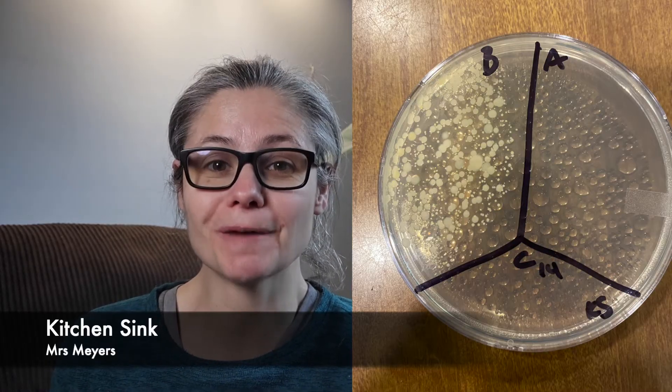The kitchen sink. In the before section, we can see a lot of bacteria there. And in the after section, there's nothing — there are no bacterial colonies growing at all. So Mrs. Meyers does an excellent job at removing bacteria from my kitchen sink.